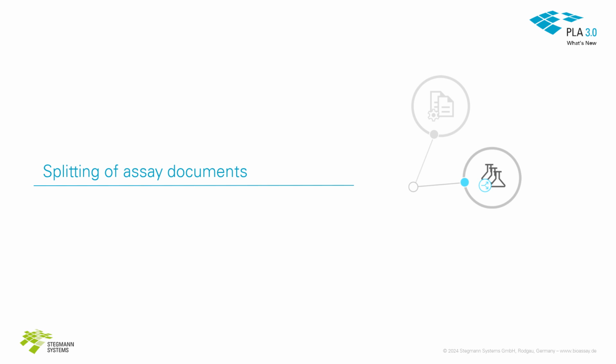With the toolkit, you can also split assay documents, according to the individual test samples they contain. This provides more control over each standard-to-test comparison, and enables an independent analytical treatment whenever necessary.